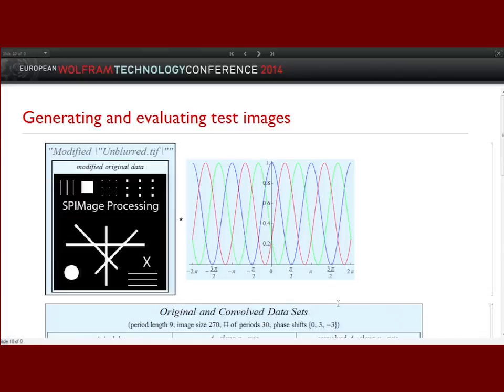Now let's have another look. What does this really look like, and what is the consequence? So here's my test image, and we used to call this a single or selective plane illumination microscope, and that's why I usually call everything spimage processing. And this object here is really pixel exact, but again, due to moiraying, you don't really see this here.